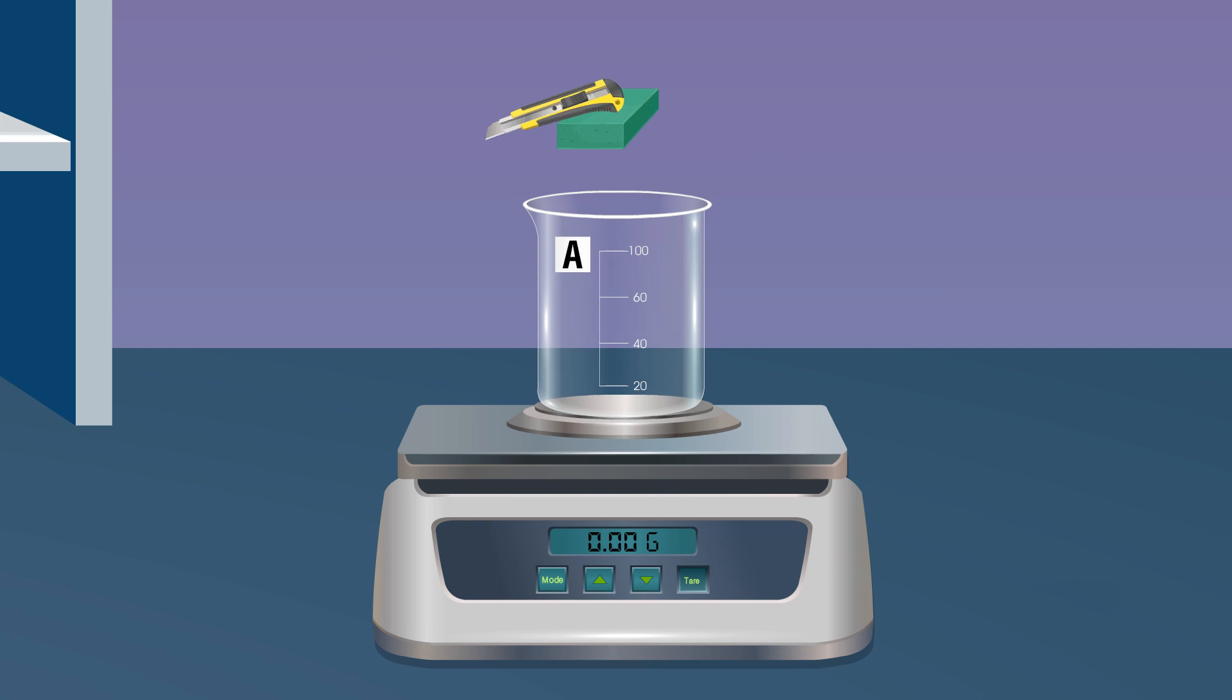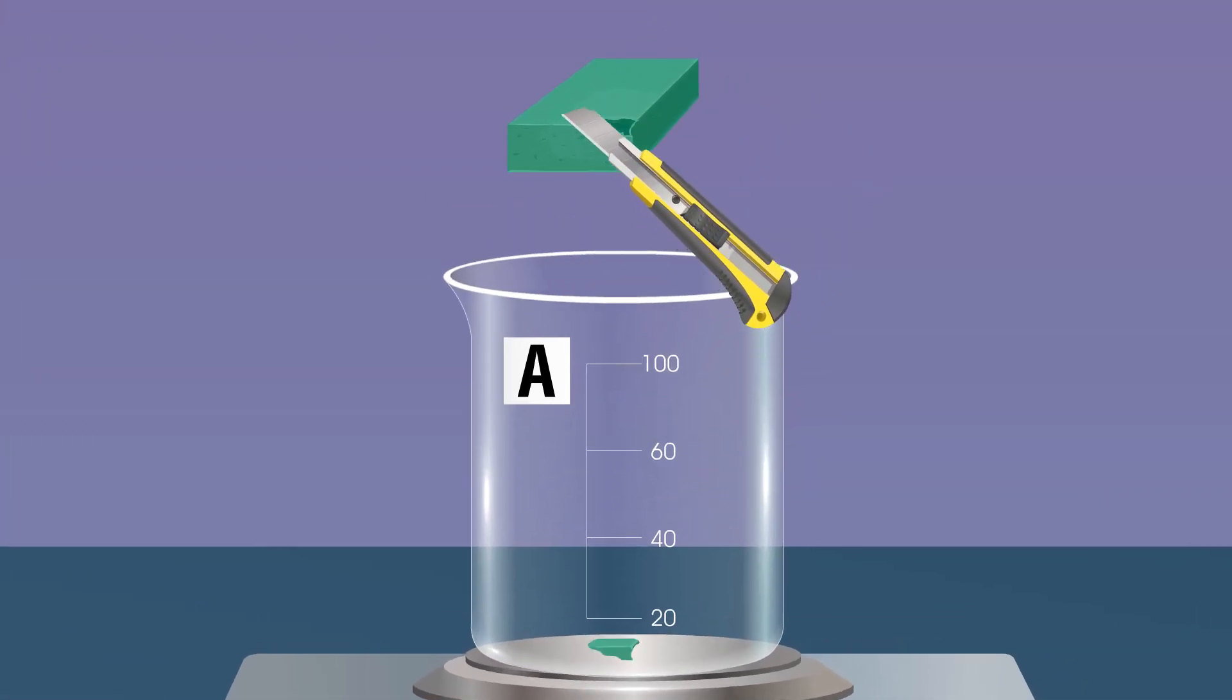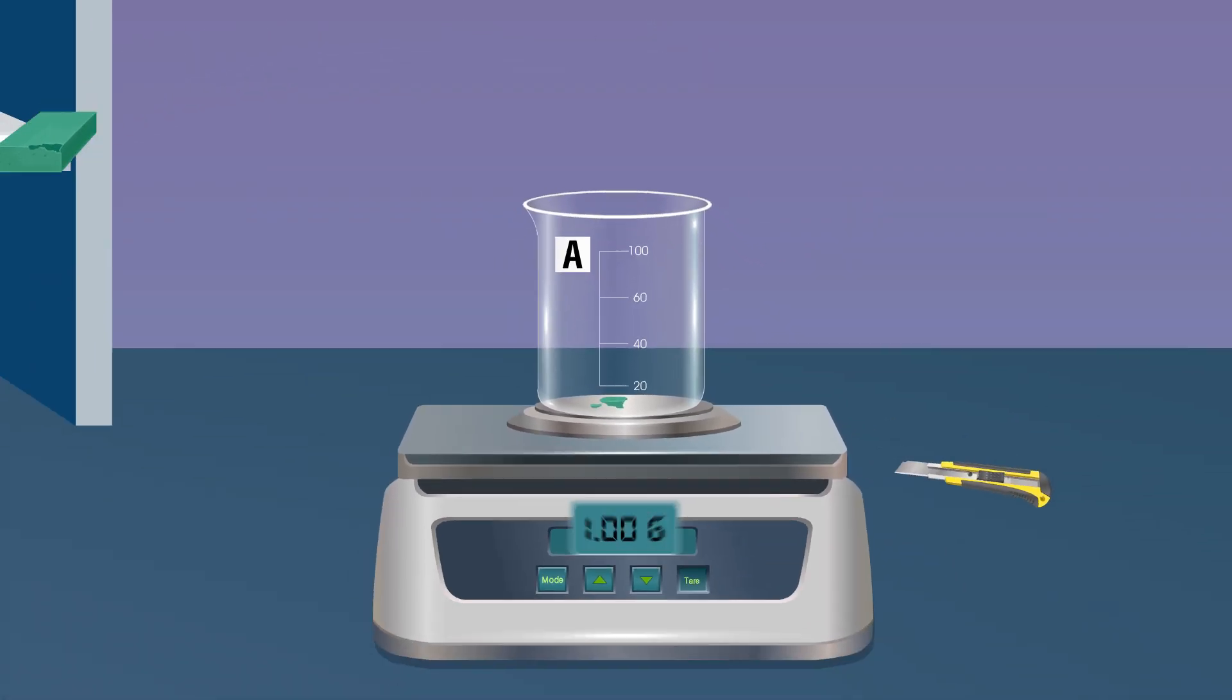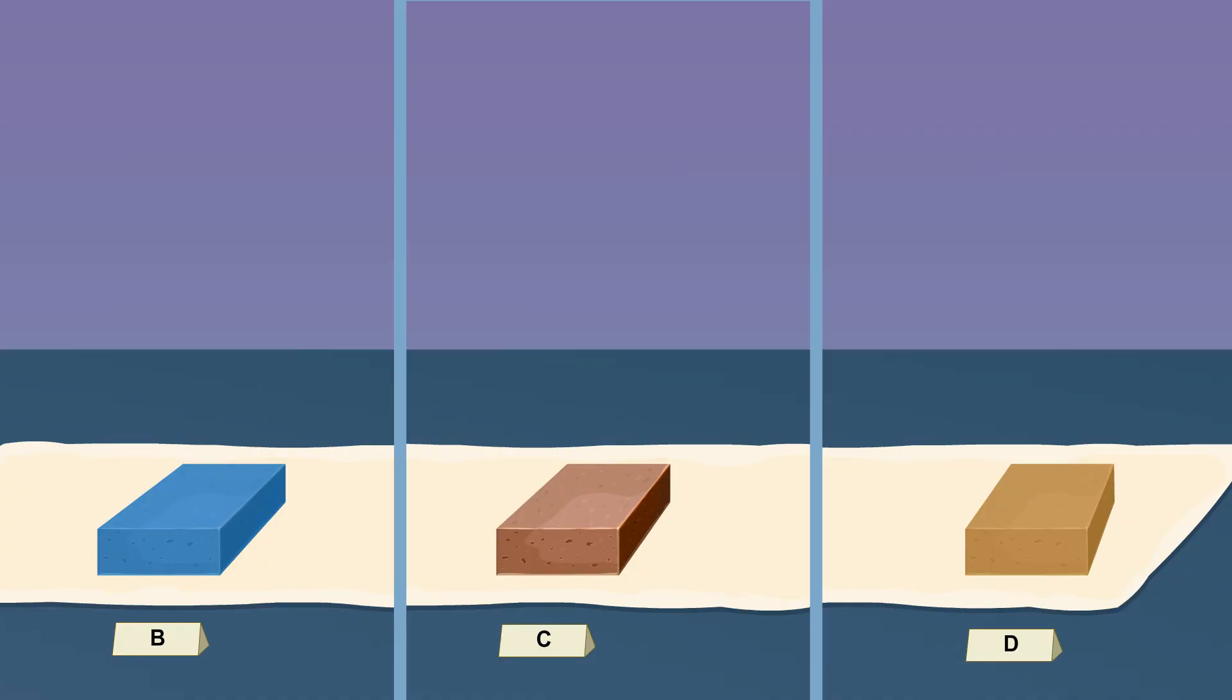Until the electronic balance shows a one gram reading and repeat the steps for B, C, and D.